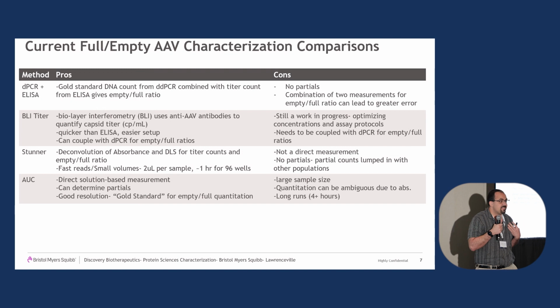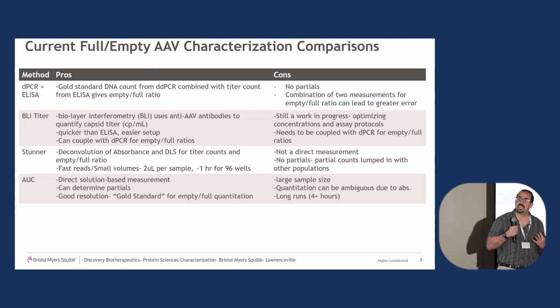So I've been the lead for our group in terms of analytics and that detailed characterization assessment that I was talking about. We had a couple different techniques already in the lab to characterize full and empty of the particles that we're purifying. And so I listed out what we had and the pros and cons of each.